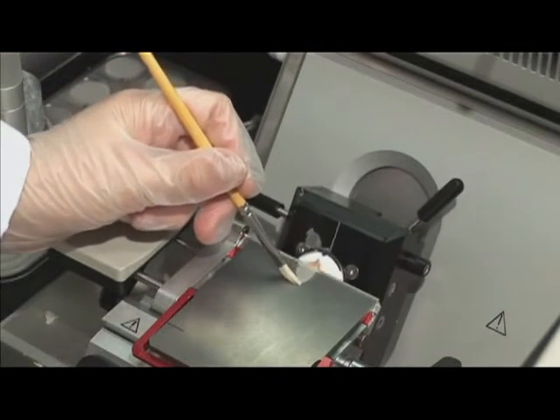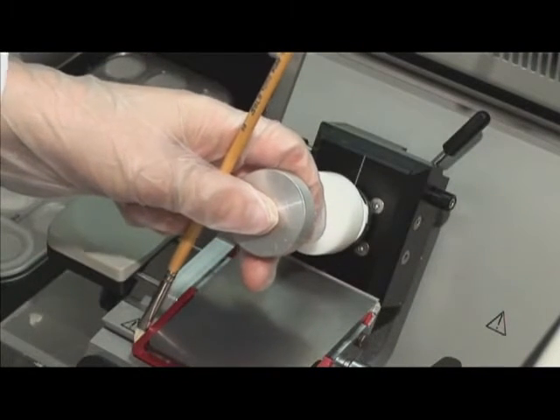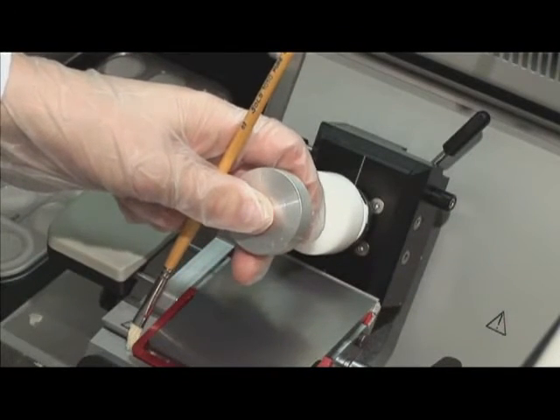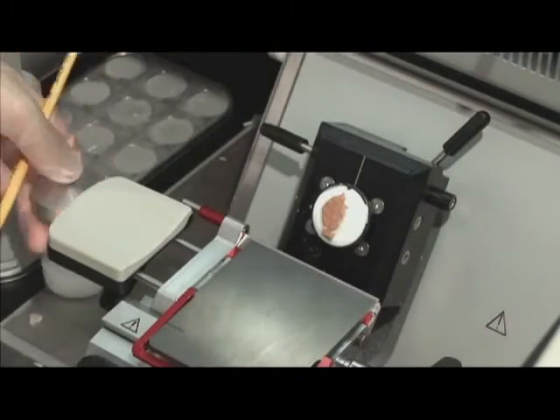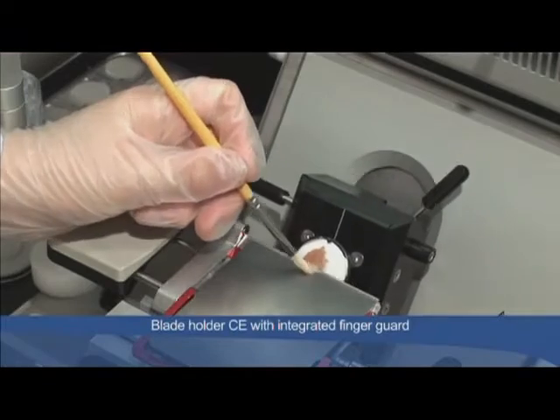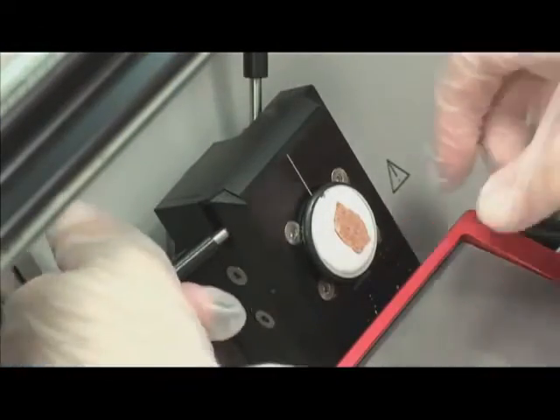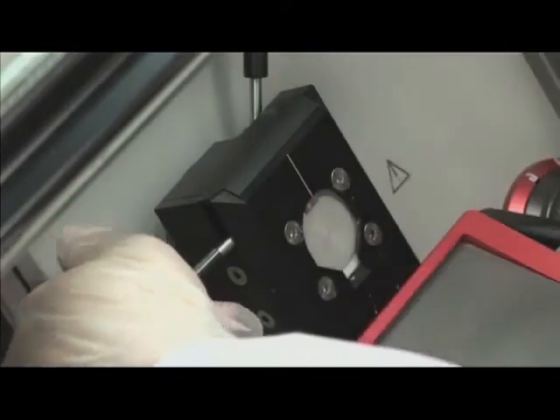The palm rest is perceived as a pleasantly warm surface. The specimen can be heated if necessary by holding the plastic side of the heat and cold extractor against the specimen. For utmost user safety when removing the specimen disc, the handwheel is locked and the finger guard of the blade holder CE is in the upper position.